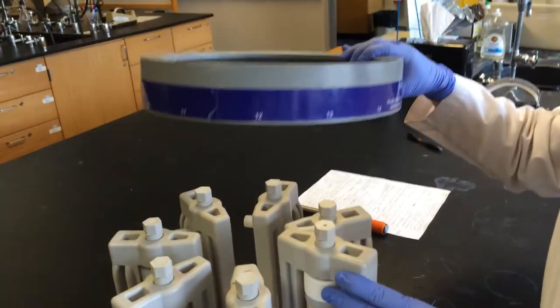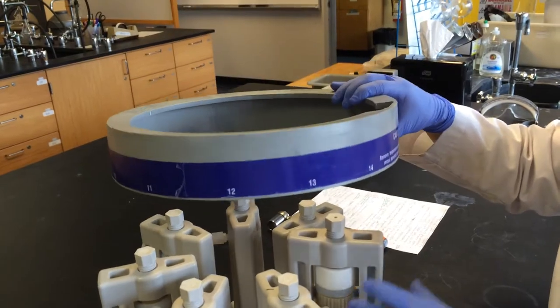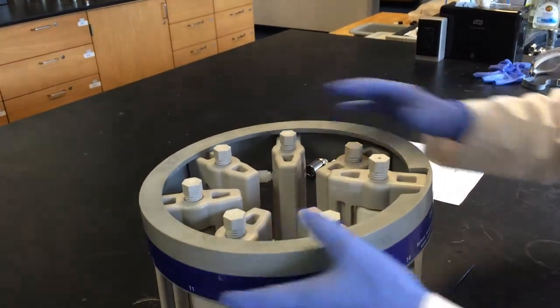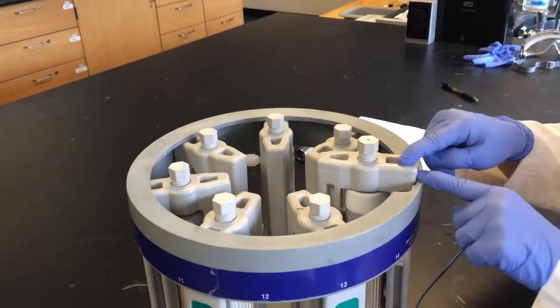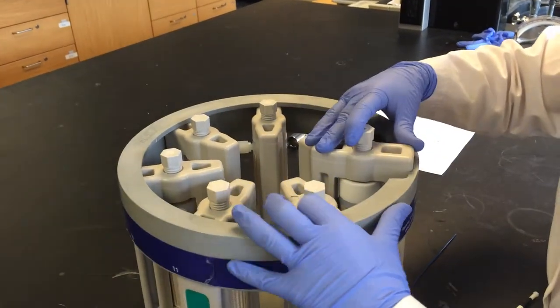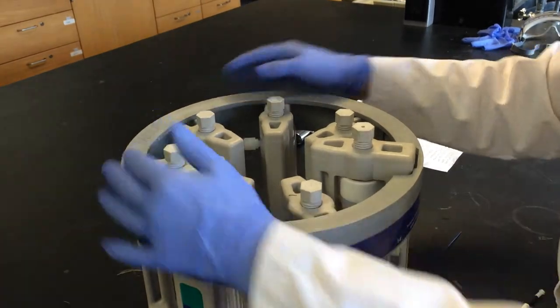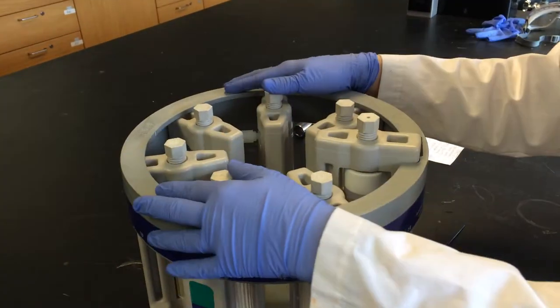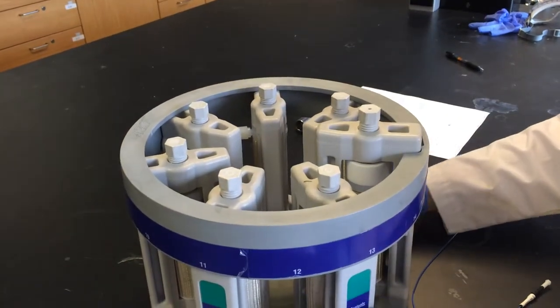Once all of the support modules are on the carousel, you place this ring over the tops of all of them. There is a small space for the control vessel. And then you turn it slightly so that it is touching the edge. And this holds all of the support modules in place.